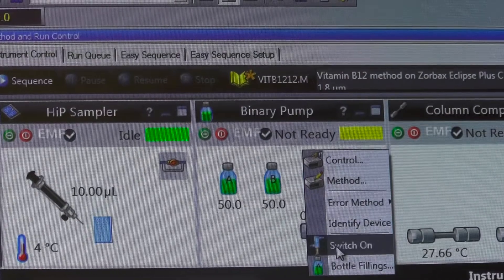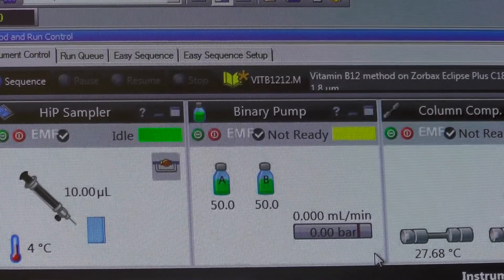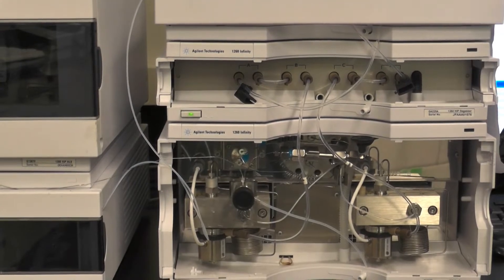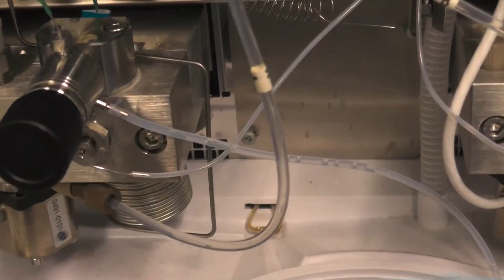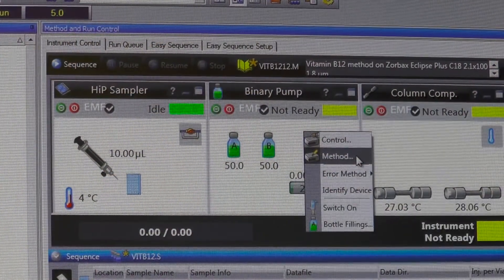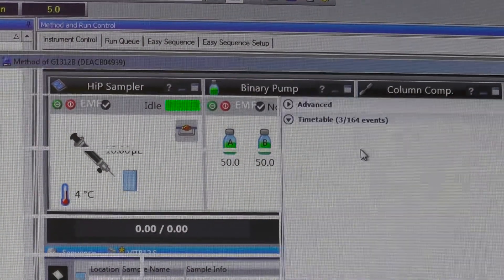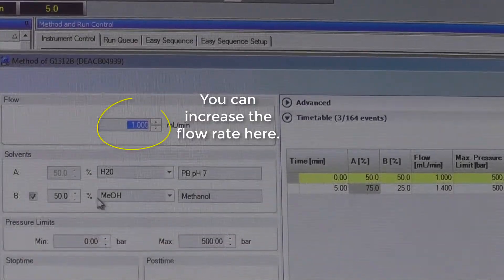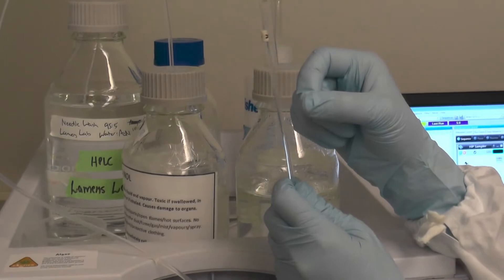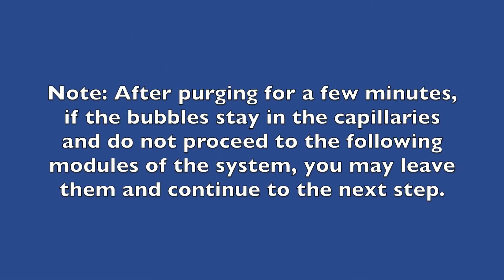Right-click on the binary pump icon and select Switch ON. Open the purge valve by turning gently counterclockwise to get rid of any large bubbles in the system. If some bubbles persist, you can increase the flow up to 5 ml per minute with the purge valve open and gently tap the capillary to remove them. If the bubbles are expected to persist for a long time and not enter the subsequent modules, then it is alright for them to stay.